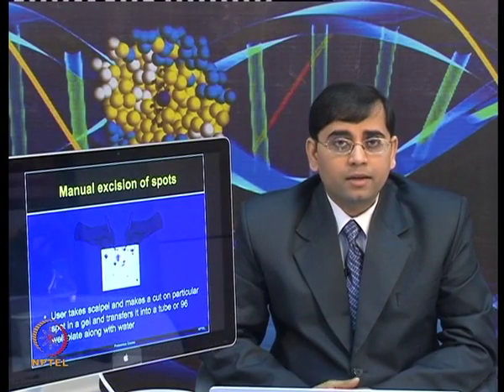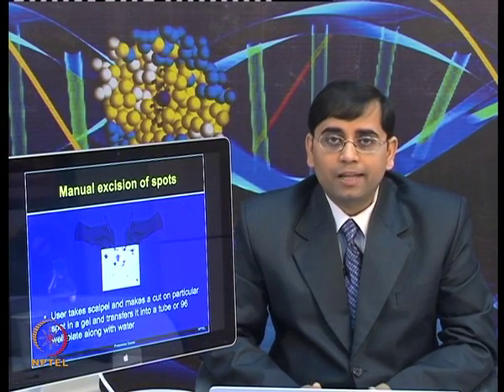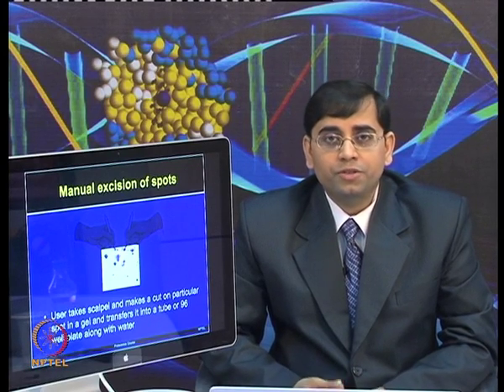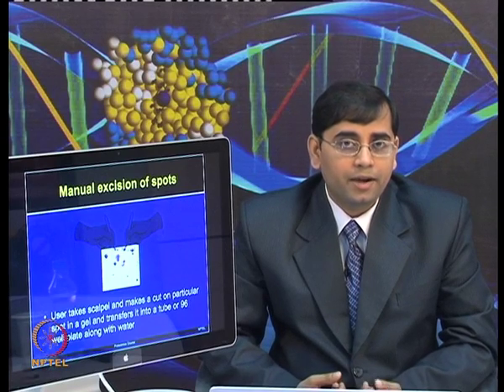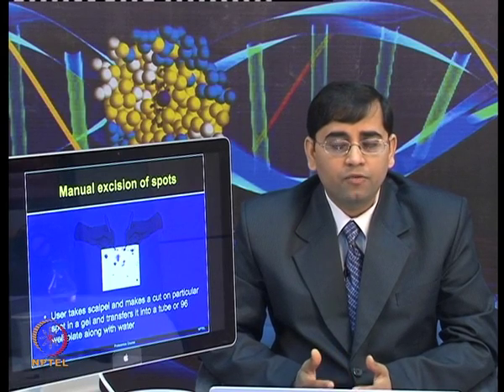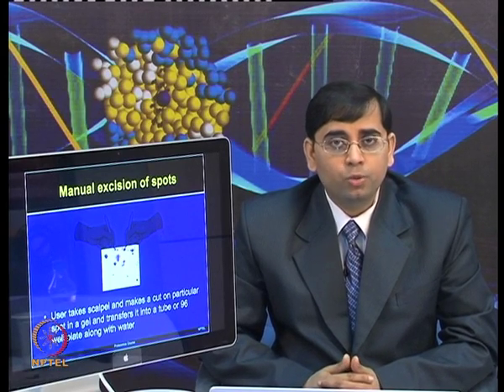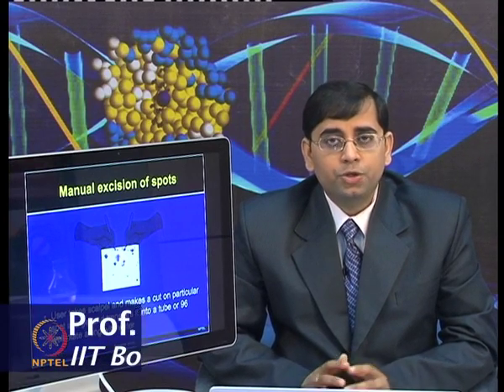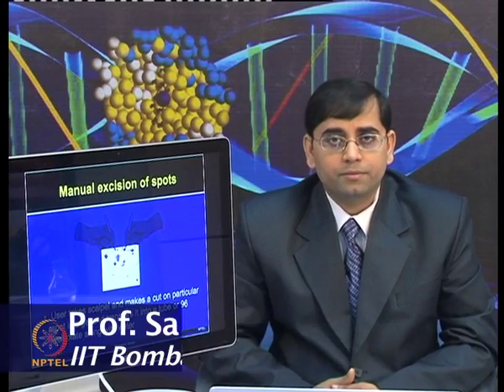You are using sterile scalpels, and the glass plate on which you are keeping the gels is also very clean. You do not want to introduce any contamination, from hair, from your gloves or from any dust particles in the environment. Preferably do these steps in sterile conditions in the laminar hood. By doing that, you should be able to pick up the spots of your interest and transfer them to the 96 well plate, which can be used for further steps such as in gel digestion and mass spectrometry.